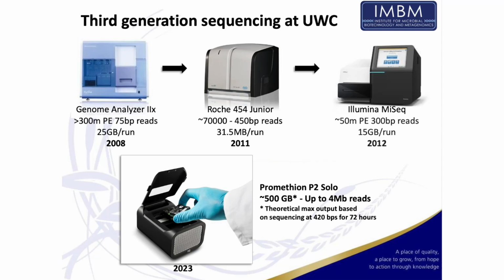And we move on to a very short while later. So Illumina today is the giant. They're the juggernaut when it comes to next generation sequencing. So they bought this company and they turned it into Illumina. So this little unit that came out called the MiSeq is the machine that has the largest install base in the world. They sold very many units, and you can see the output.